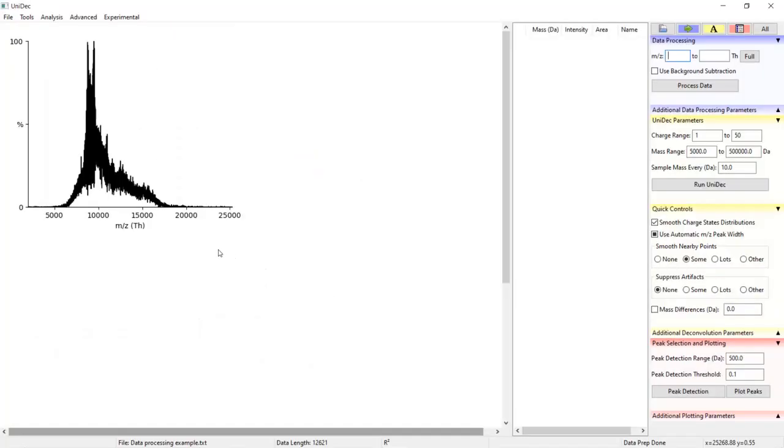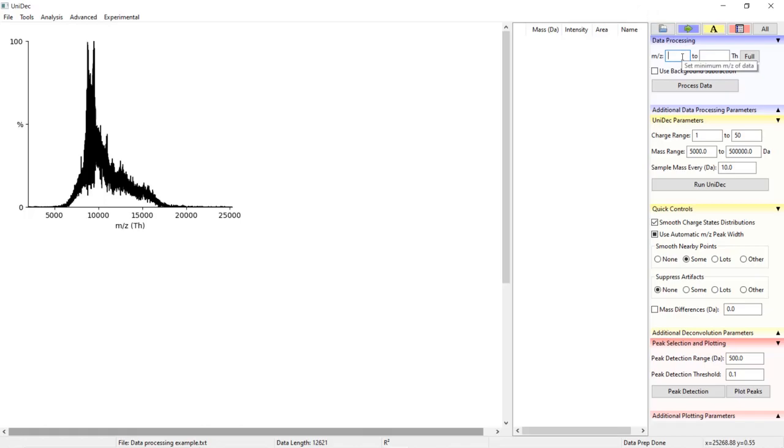We begin processing our data by selecting an M over Z range, and this can be done in a number of ways. We can manually enter an M over Z range. I'm going to pick a minimum of 5,000 and a maximum of 15,000.